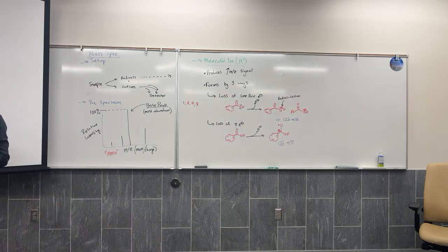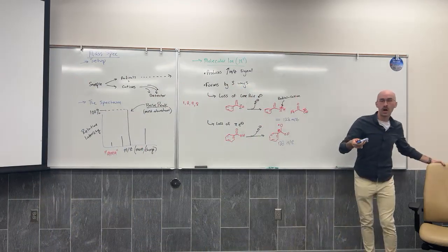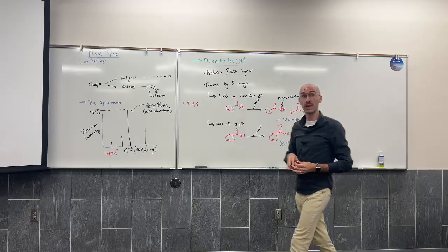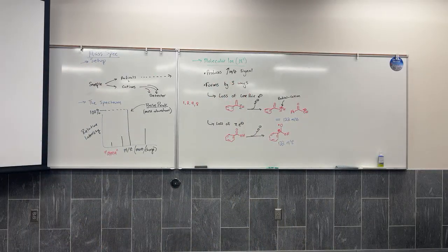And we broke that pi bond because it wasn't part of the ring and it's easier. I want you guys to now break a different pi bond and show a different molecular ion that forms by loss of a different pi electron. Deal? Take a minute. You've got 3 other options for what it could look like. Draw a different molecular ion by loss of a pi electron.